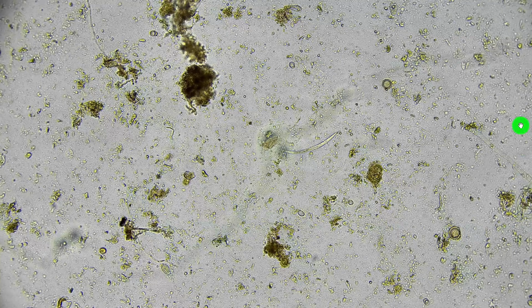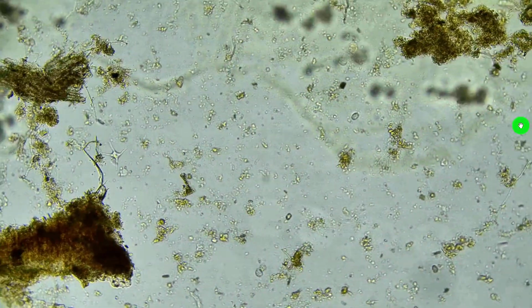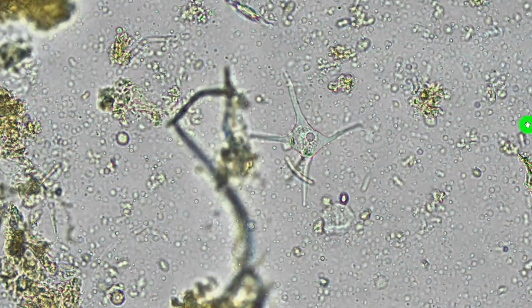More nematodes, more testates, and I'm really trying to get to the other side of this slide. And this is, by the way, I'm barely going up or down. I'm just going across. And this is 3 drops of water spread out on a slide. Look at this guy. That is cool. This is like a star amoeba of some sort.